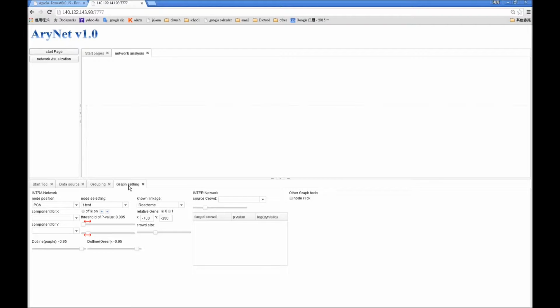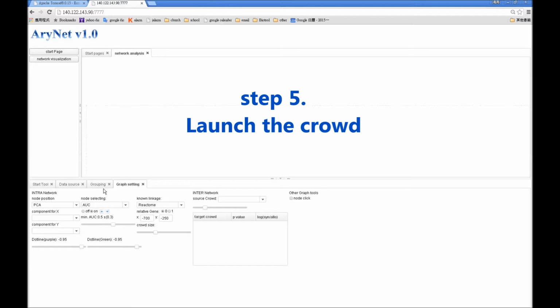The 2 scroll bars in the t-test meter box regulate different scales of threshold p-value. The lower scroll bar increases the p-value by a millionth per sliding, and the upper one increases it by a hundredth per sliding. The scroll bar in the AUC meter box decides the threshold of the area range of the ROC curve of differential expression genes.